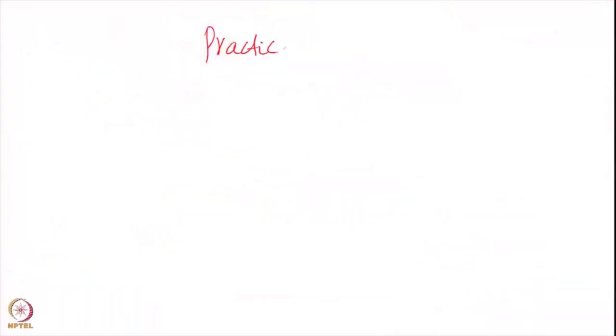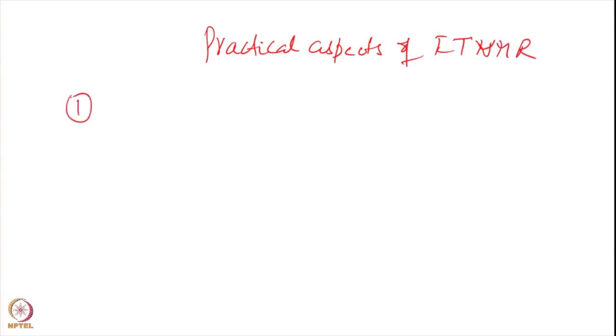So let us now look at the practical aspects of FT-NMR. First, offset, or it is also called the carrier frequency. What is the meaning of this? Now we are exciting all the frequencies in one go here, right?